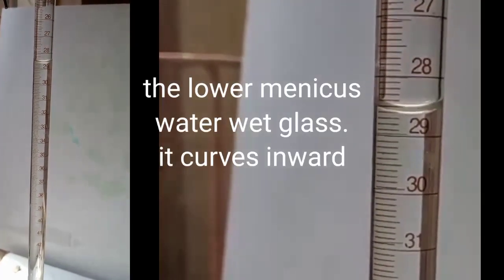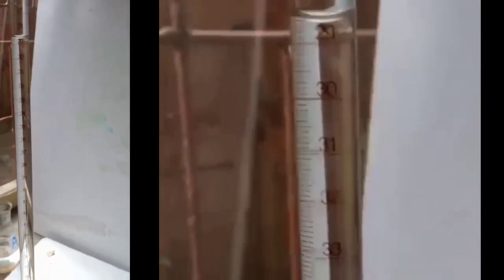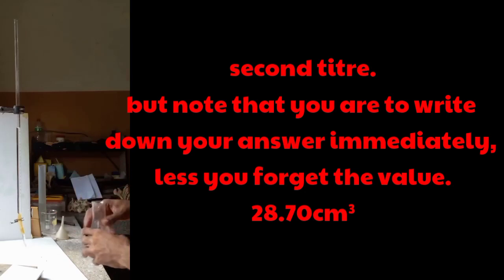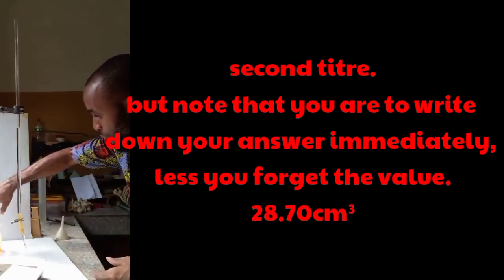Now we have the expected color change. I'm having it at 28.7. Therefore, I need to do this practical a second time. Let's go. I need to keep this safe for you to know the color change we are expecting to have.